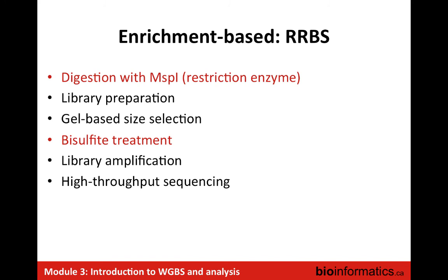enriching for DNA, because one of the challenges, and we'll get to that when we do whole genome sequencing, is that to cover the whole genome, you end up having to sequence quite a bit. So here the advantage is that it specifically cuts regions with CGs, such that it enriches your DNA fragments for reads in CpG islands and in CG-rich regions. So this is just a strategy to enrich which region of the genome you're looking at, and then you follow with the bisulfite treatment, which we talked about.